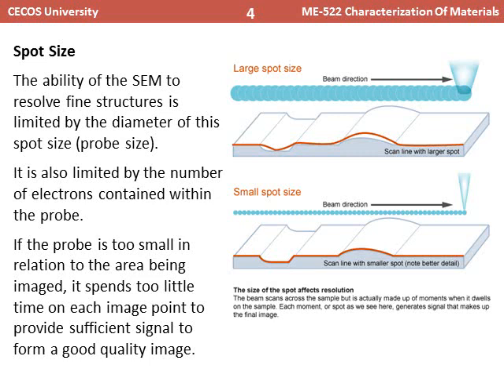The next and very important terminology that we are going to discuss here is the spot size. By means of spot size, we actually resolve the fine structures over the surface of the specimen, or the surface morphology of any subject.